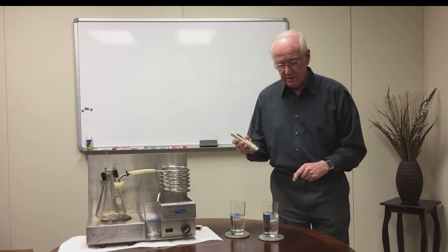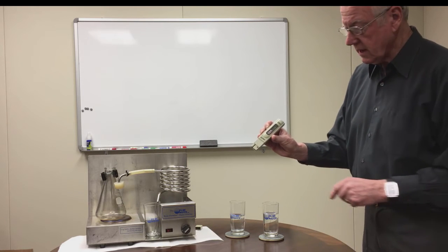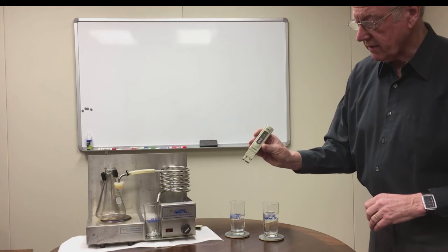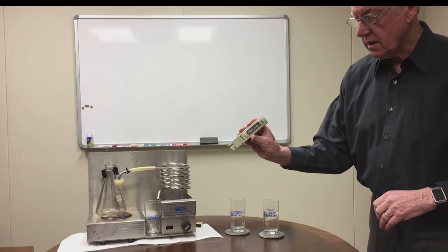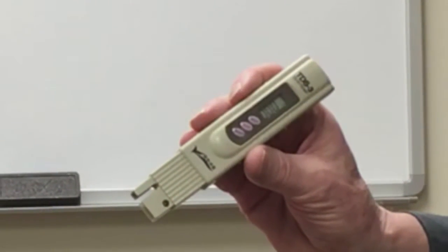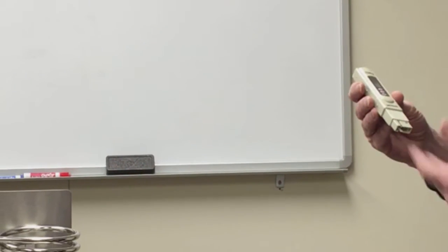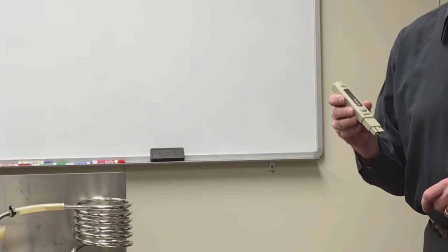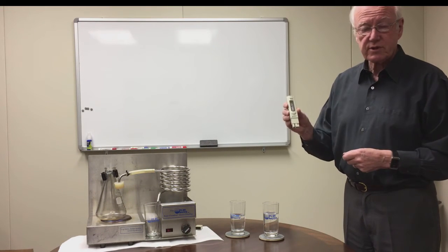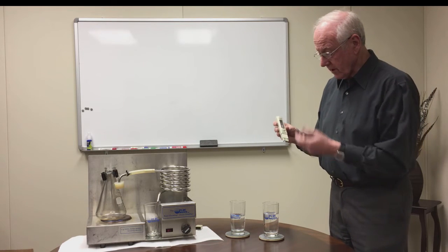This is the TDS meter — it is a temperature-adjusted unit with a digital readout. If you can zoom in on that, we can see that this has got a reading of zero zero zero. There are two electrodes in here, and the reason it reads zero is there's no electricity passing between those electrodes. There is a battery in here, so it's charged, and if I put this into water that has materials that can conduct electricity, it will create a reading.